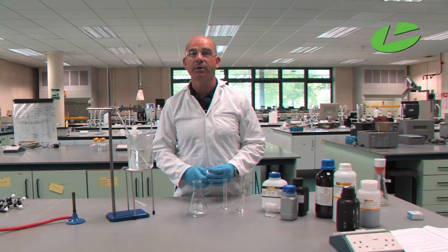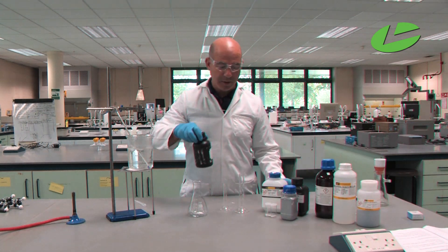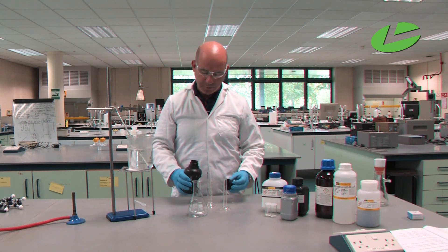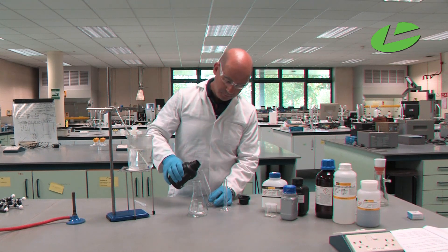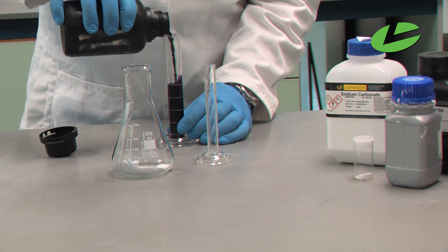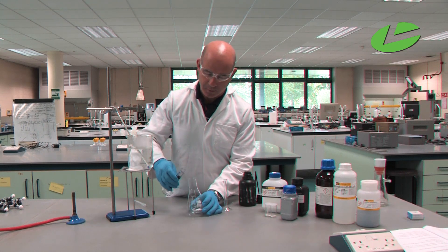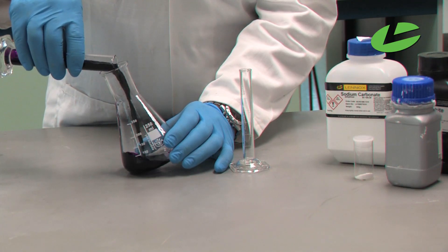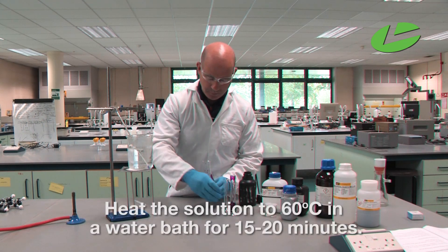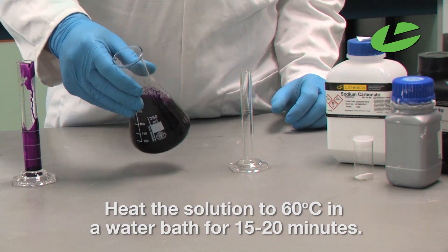To that I'm going to add my oxidizing agent. My oxidizing agent is potassium permanganate, and I'm going to use 25 milliliters of 0.05 molar potassium permanganate solution. I'm going to add that into the solution.